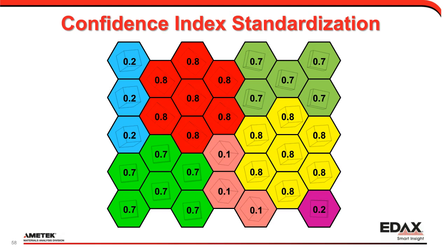Very difficult question here about IQ separation of bainite from martensite. It's very complex since the dislocation density is smaller. What is my suggestion to manage it? I think we have a technical note on that, and there's a paper on that, which I'll send out to you. It can often be a combination of IQ and other values to do that. I'd also tell you to play around with PRIAS. PRIAS gives us quite good results on things like that.